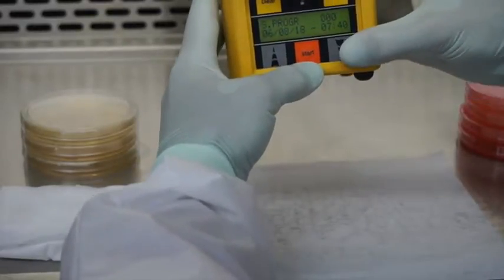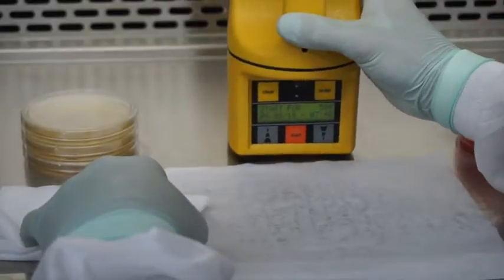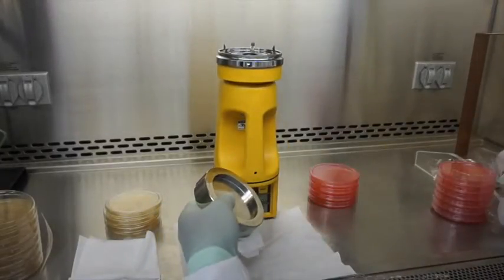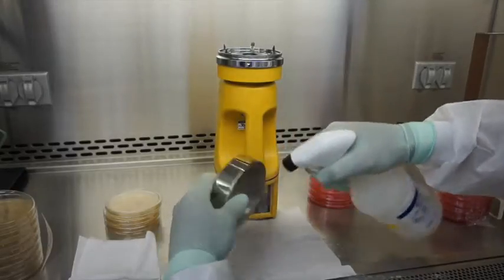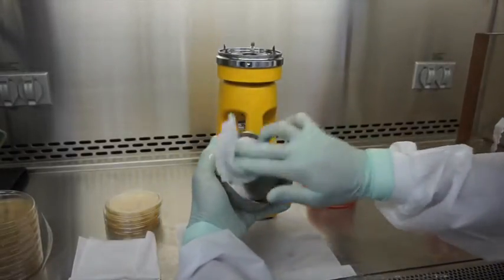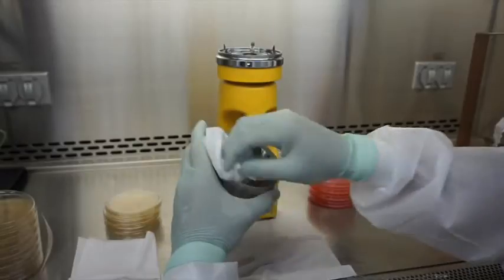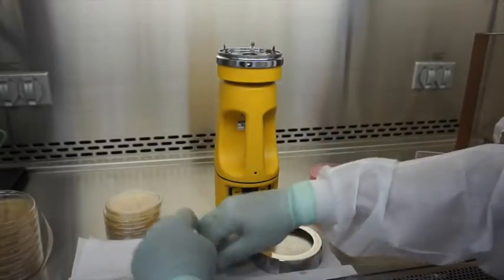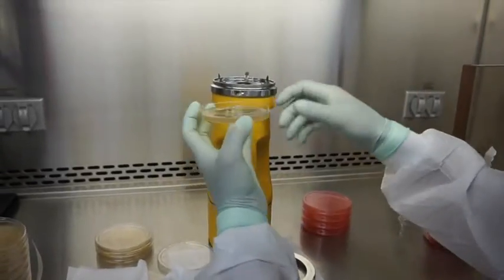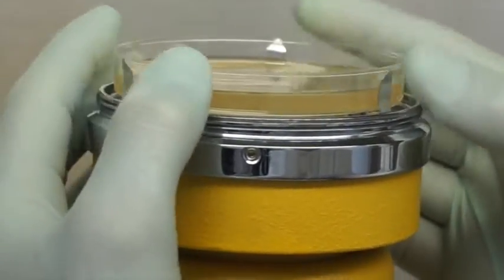That will take you to different set volumes. In this case we're doing 500, so once you get to it you hit enter and that's going to take you to a start screen. When you go to load the media plate into the head of the air sampler, make sure to clean and wipe down the head really well — be liberal with the alcohol and wipe it down with the alcohol pad. When loading the media plate, use aseptic technique, hold the petri dish from the sides, and it sits securely right up in those three prongs.